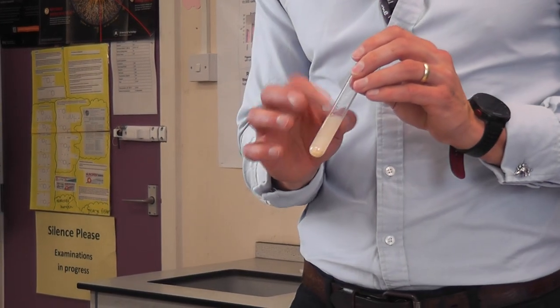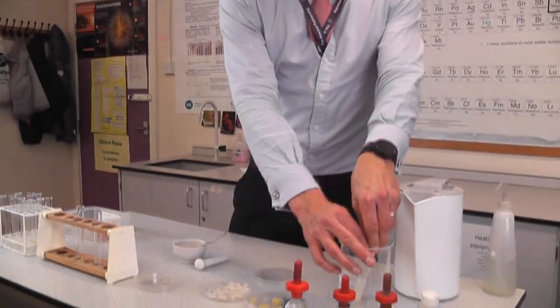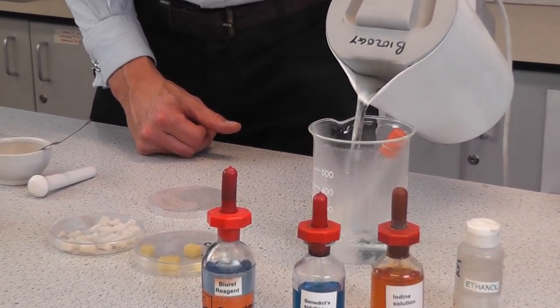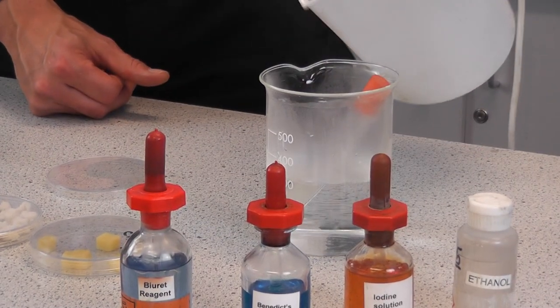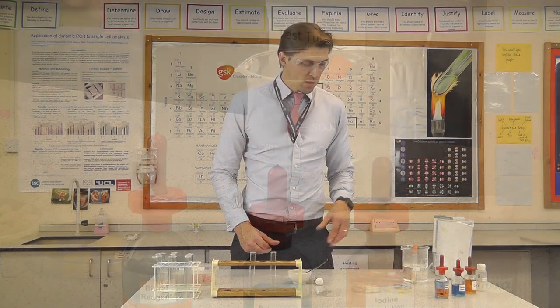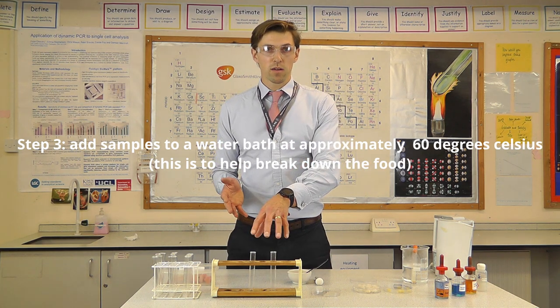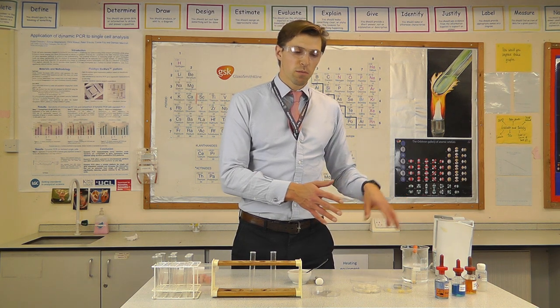I'm going to put the test tube into a water bath. I've pre-boiled a kettle and I'm pouring the water into this large beaker. Normally in the lab you'd use a water bath pre-set at around 55 to 60 degrees. I'll do the same for the bread and cheese samples, then leave them for around five minutes.